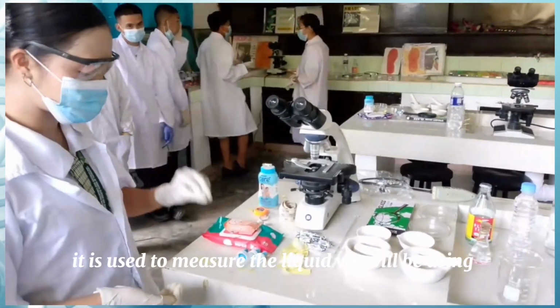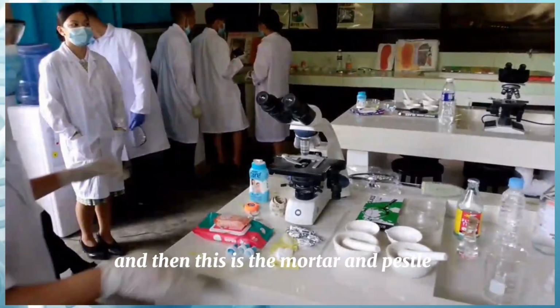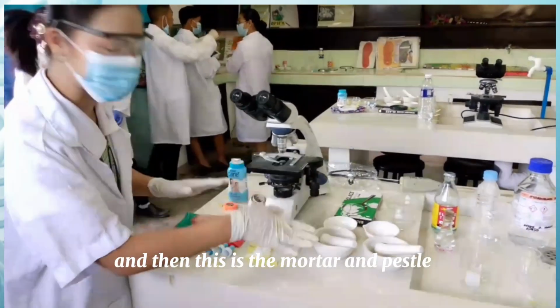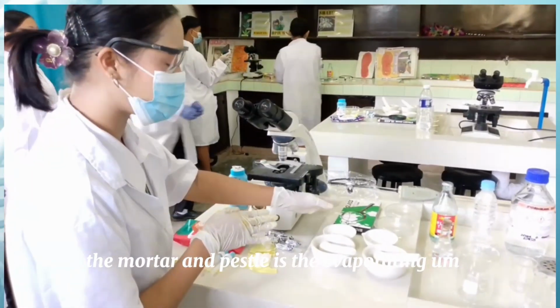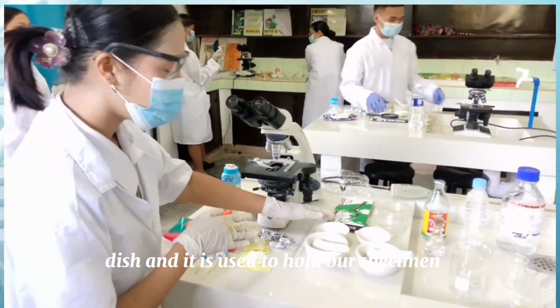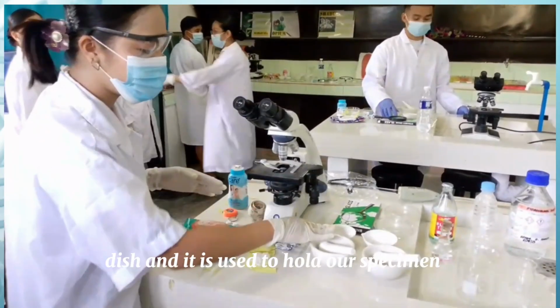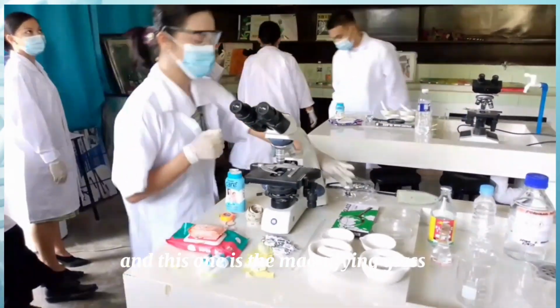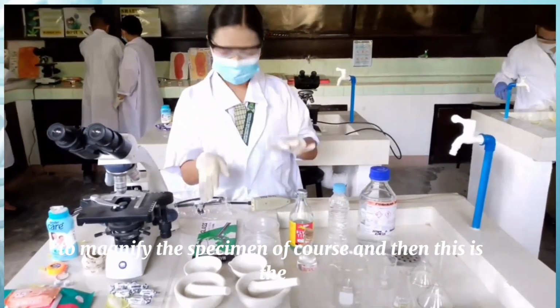The dropper is used to measure the liquid we will be using, and then this is the mortar and pestle. This is the evaporating dish, used to hold our specimen, and this one is the magnifying glass, to magnify the specimen, of course.